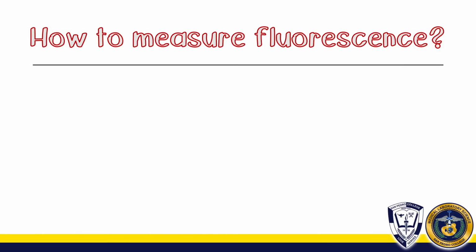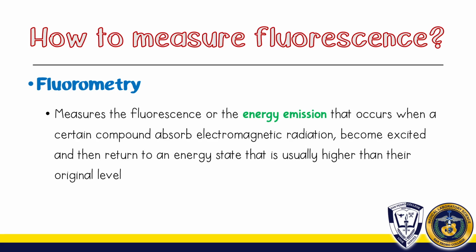Now, how to measure fluorescence? What do we use in order to know what level of re-emitted light we have in your fluorescence, or actually even phosphorescence? That is the way to measure. That is what we call your fluorometry. So let me just read the definition of fluorometry.